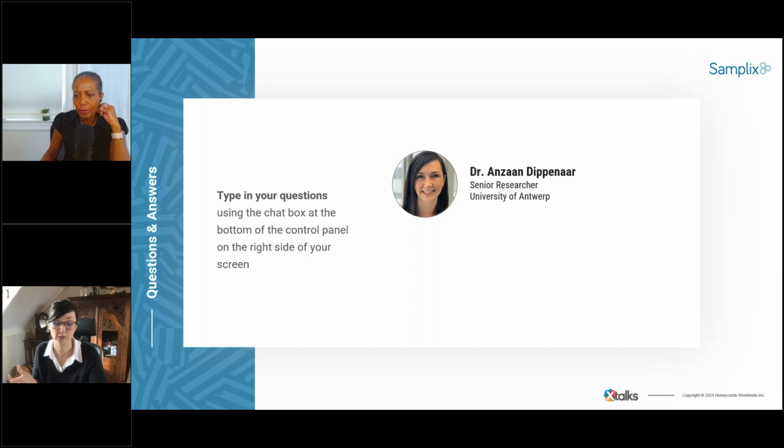It can withstand a lot. So if you can apply very specific methods to lyse almost everything else and then do a pre-treatment such as DNase or another enzyme, or even just a washing step to get rid of the released DNA, that could really clean up your sample and enrich for the MTB already. So we're looking into methods that could enhance that.